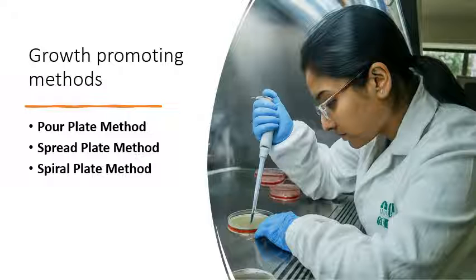The pour plate method can also be carried out by inoculating the same 0.1 ml inside McCartney bottles that is containing the molten agar and poured together.